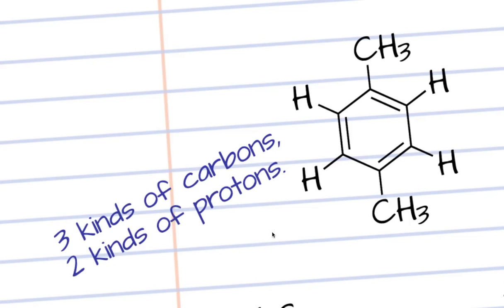Is it the right structure? Well, we can look at the details of the proton NMR, carbon 13 NMR, and the IR, and we will see that the bending band in the IR spectrum tells me that it's para-substituted. The characteristic frequencies there around 1750 tell me that it's a para-substituted phenyl ring. The IR actually told me all about this. In the proton NMR, I can see a signal at 7 parts per million, characteristic of hydrogens on an aromatic carbon. And then the methyl group also was easily seen in the proton NMR.